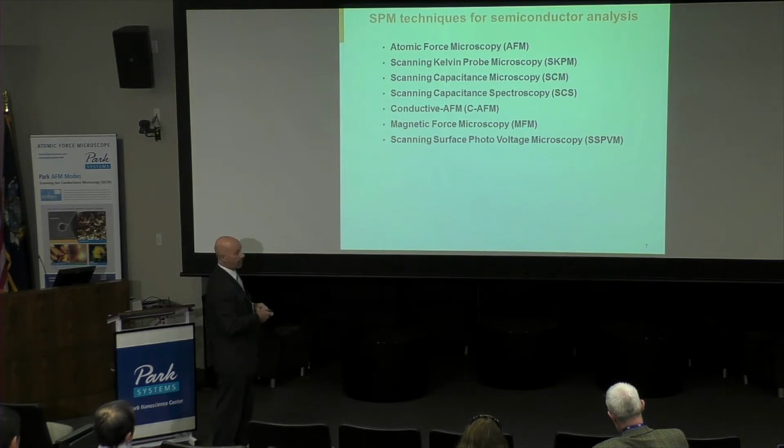We use conductive AFM for looking at dielectrics. As devices continued to shrink, the dielectrics kept getting thinner and thinner, such that a single molecular contaminant, a single molecule in the wrong place, would render a device malfunctional, anomalous, and could render a whole chip basically useless.